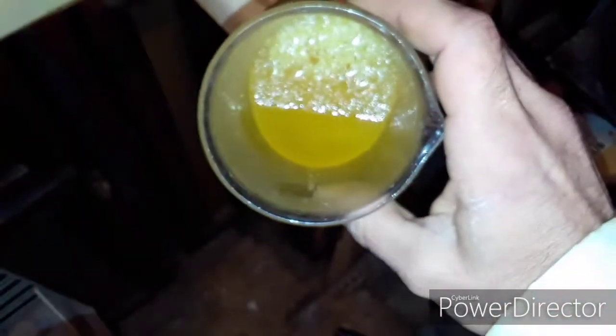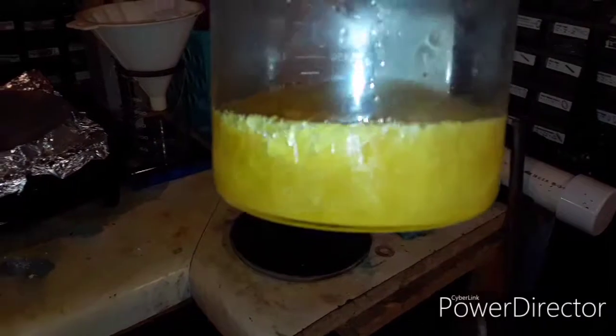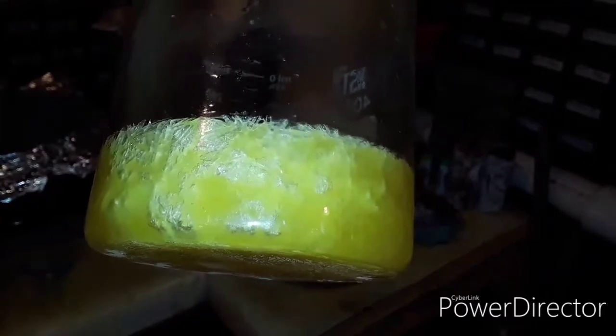So, as I suspected, there are just a ton of crystals in there. Wipe off the condensation. This is what we have here as a side view. And you can see as I tilt the solution away, they become nice and bright white.